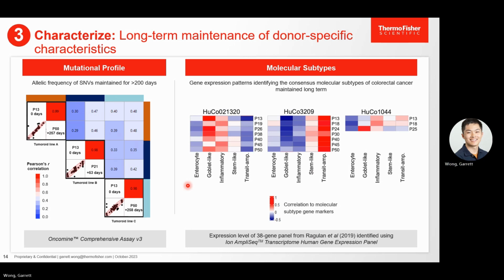And you can see that each of these lines has its own distinct molecular subtype that they are expressing.